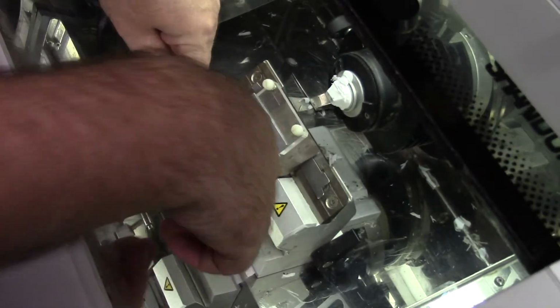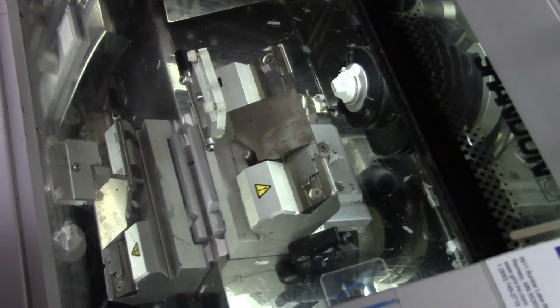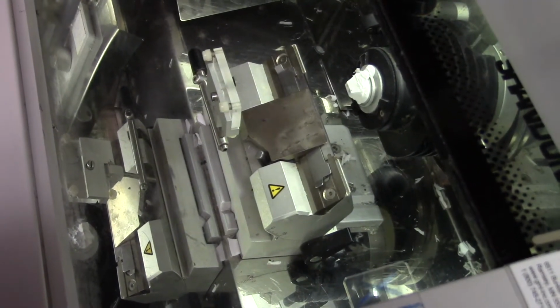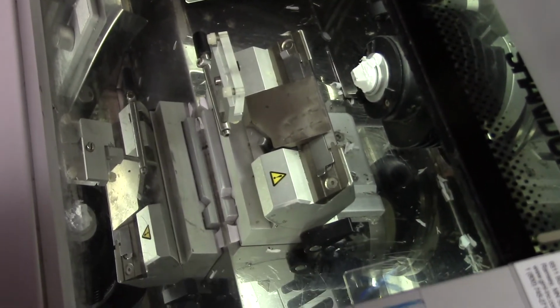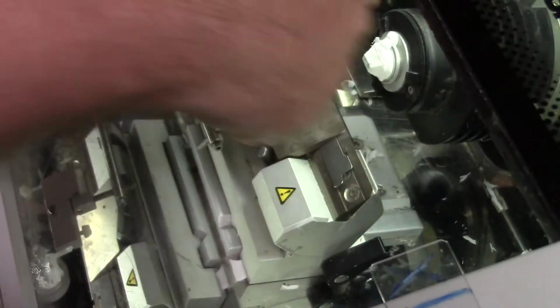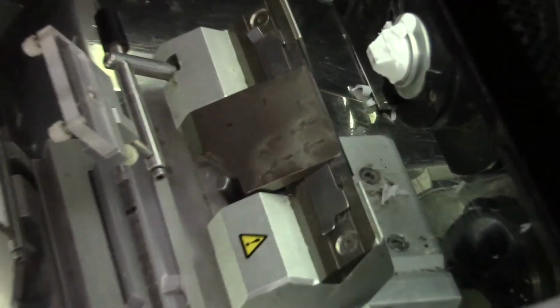This right here is a roll guard. When you shave ice, it curls. As you cut it, there's pressure, and then in the area where it's exposed to the air, it's melting, and so it curls. So we don't want our tissue to curl, we want it to lay flat on our microscope slide. So we're going to slide our little cutting of ice underneath this glass and onto the metal plate.